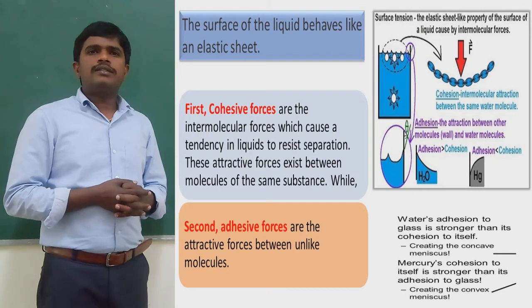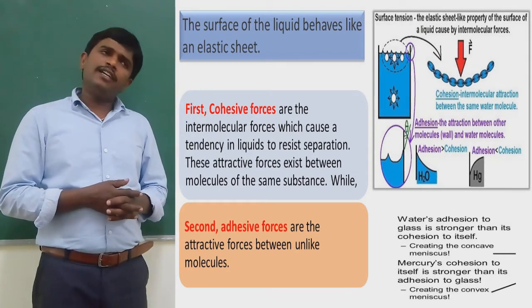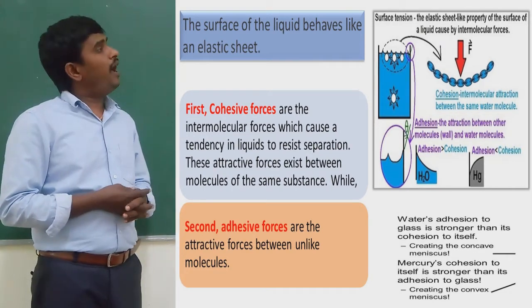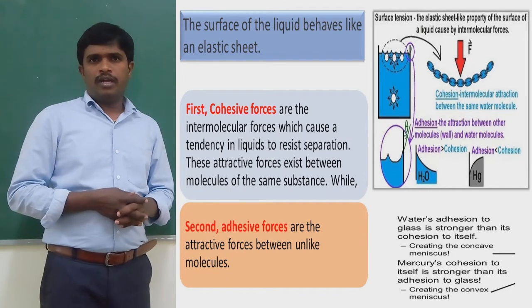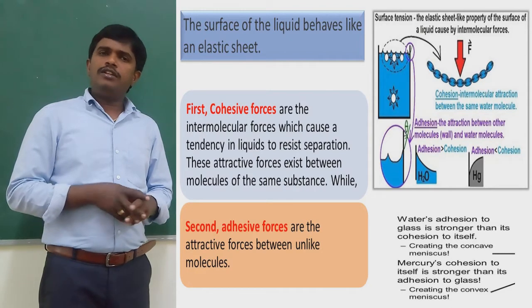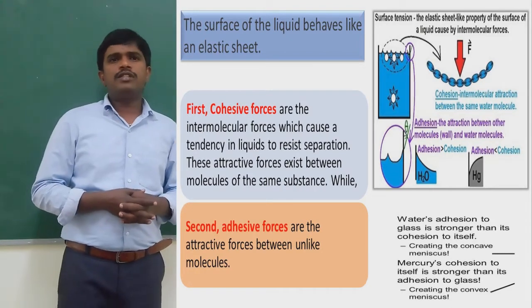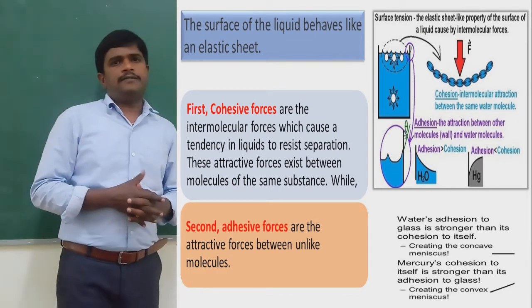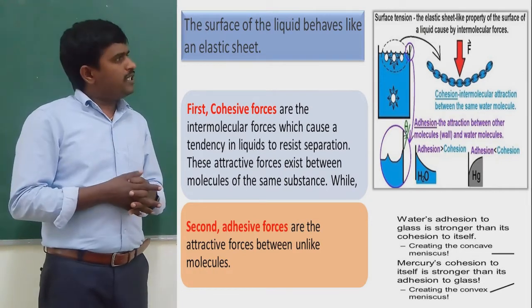While the second one is adhesive forces. These adhesive forces are the attractive forces between unlike molecules. They are caused by forces acting between the two substances, such as mechanical forces and electrostatic forces, that is, attraction due to opposing charges.